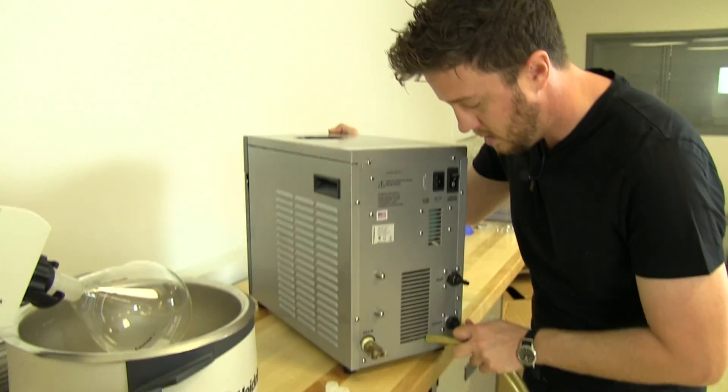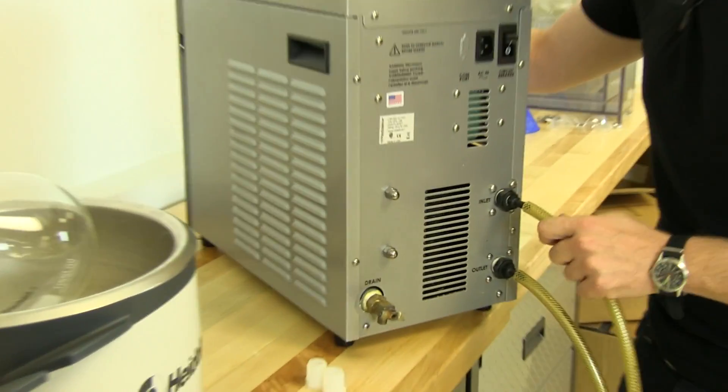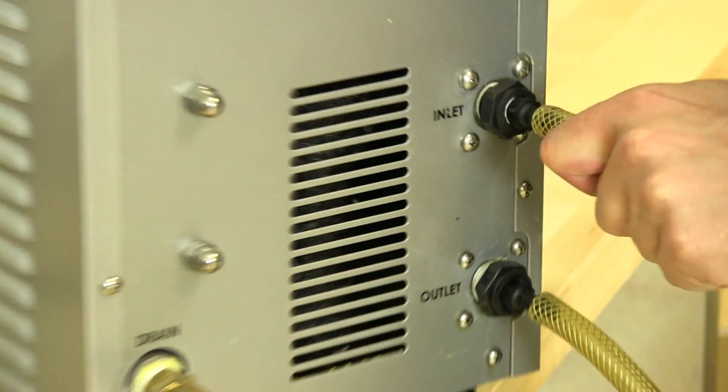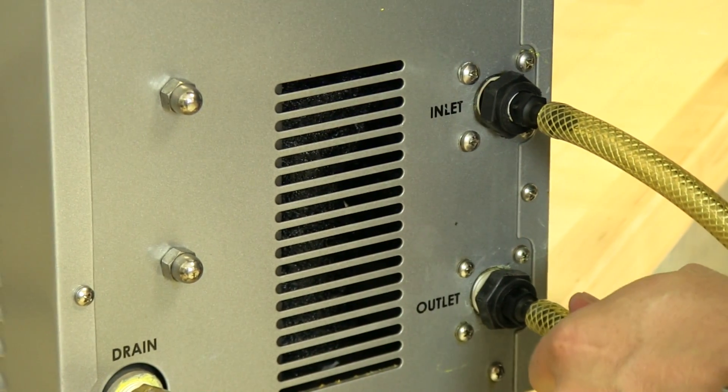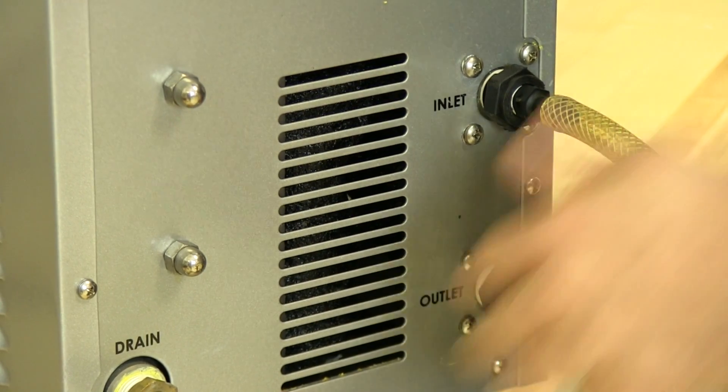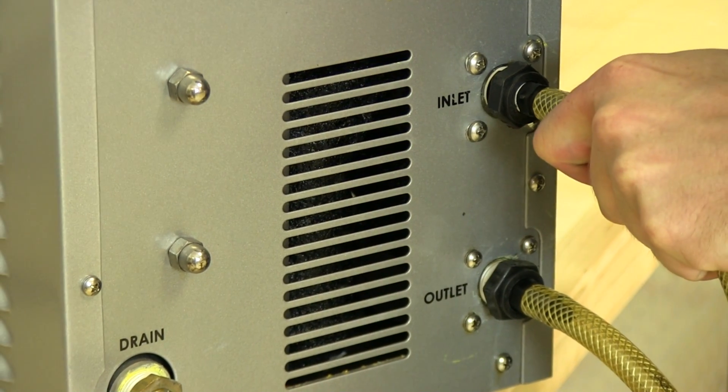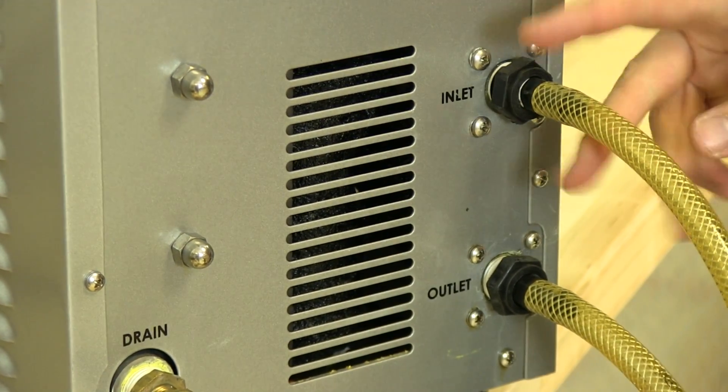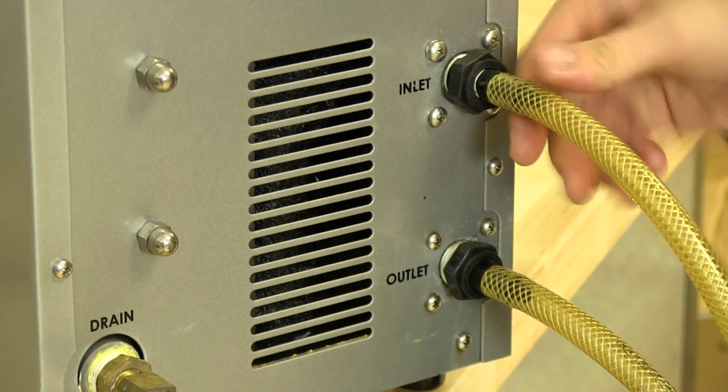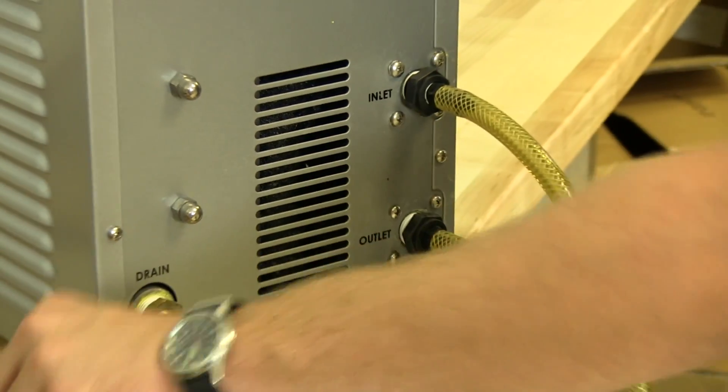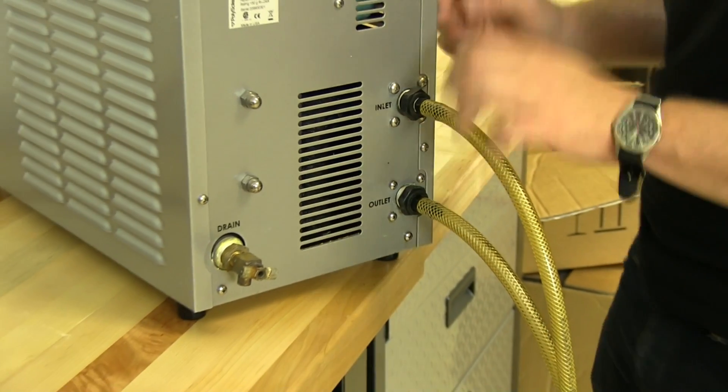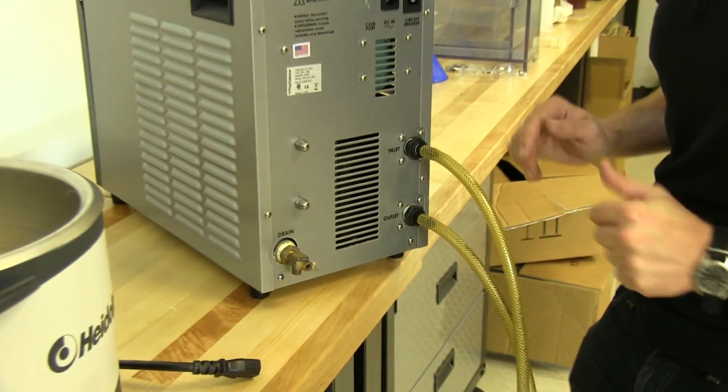So we slide them on, getting them all the way on. Again, you can have hose clamps that you connect here and tighten, but it's not always necessary. This should be an adequate seal.